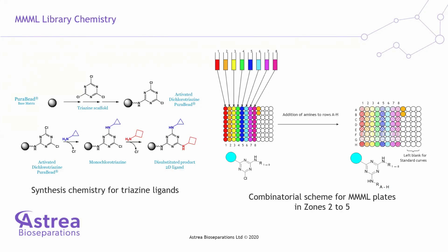The triazine chemistry allows for the attachment of two different or the same molecules with different characters. So you can put something that is more hydrophobic, and on another side something more electrostatic, and the combination of those two positions adds the variability to the ligands. So that's the chemistry.